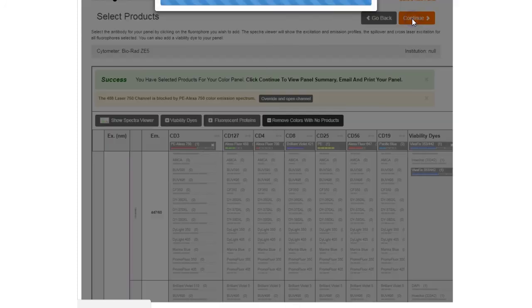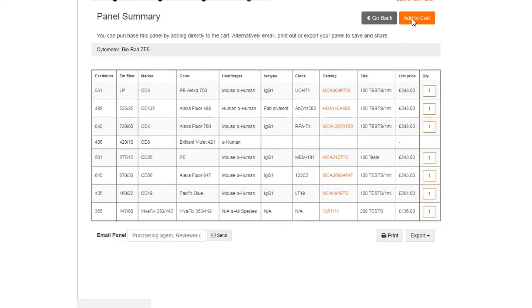To see all your selections, view panel summary. You can then easily buy products by adding them straight to cart.